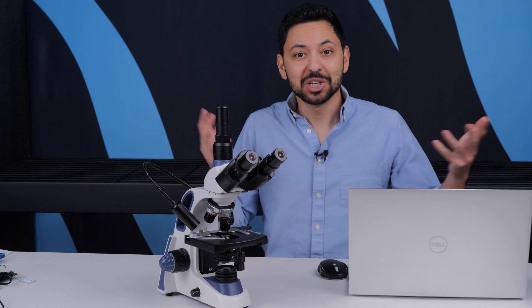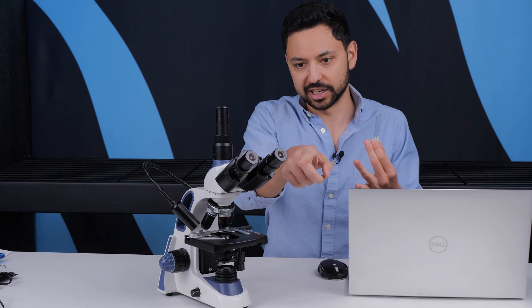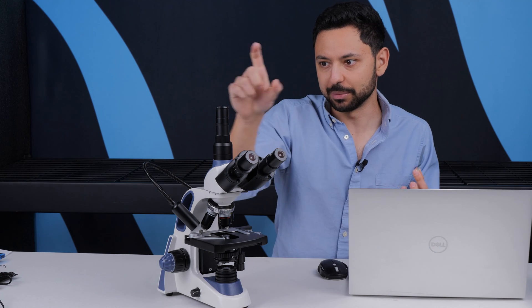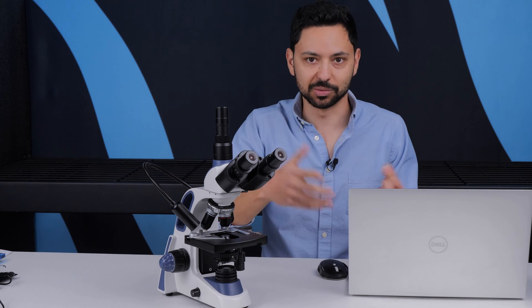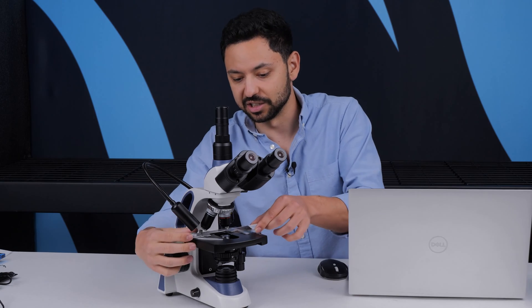So how do you take pictures on a microscope? I'm going to show you putting your phone up to it, having an actual smartphone microscope holder, a USB microscope that goes up through the eyepiece, and then a more professional camera that goes on the trinocular port, which can either go to your computer via USB or put images onto an SD card.